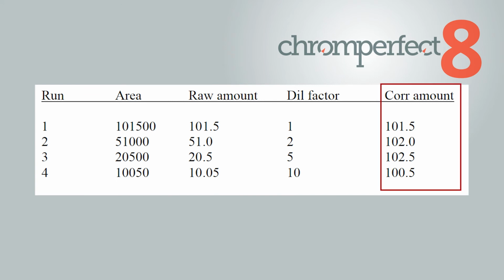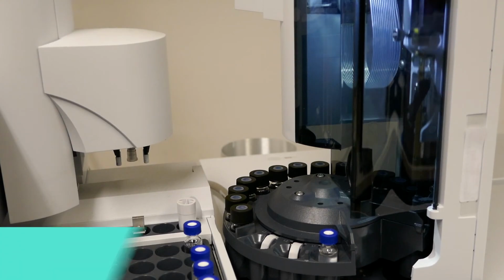When using internal standards, the value of the dilution factor should reflect dilutions made before the sample is spiked with the internal standard. Dilutions made afterward affect analyte and internal standard equally, and do not affect the response ratio. These dilutions should not be considered when calculating the value of the dilution factor.